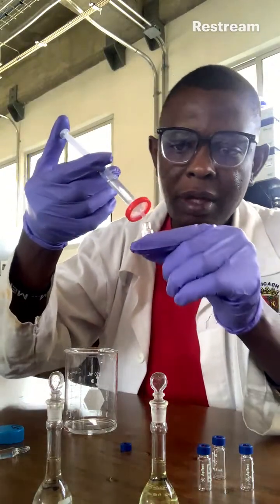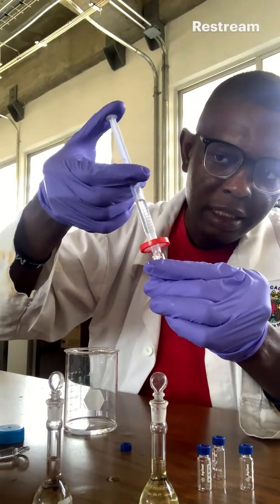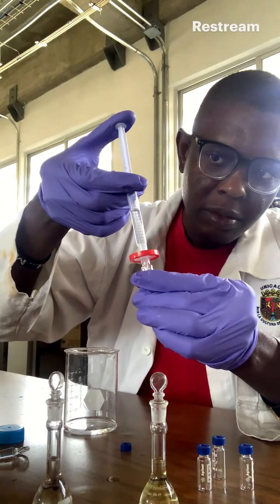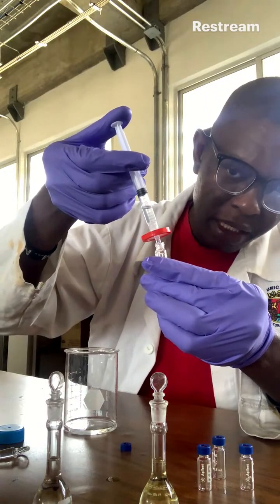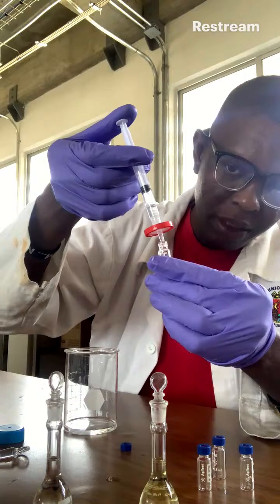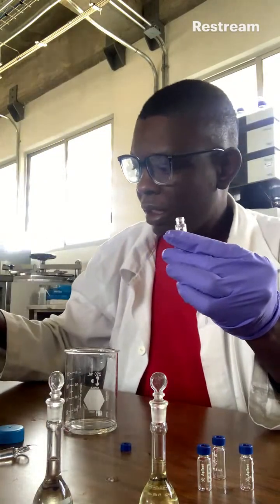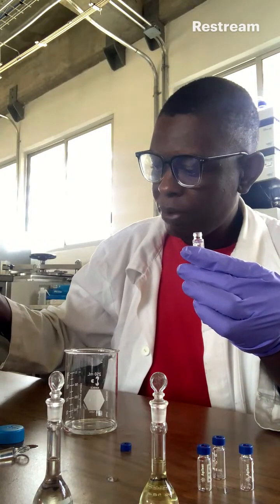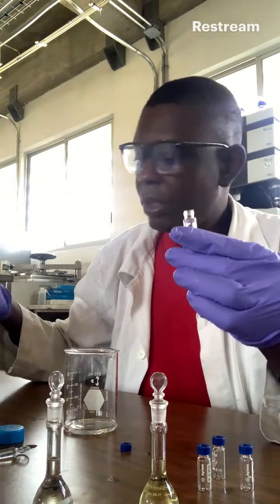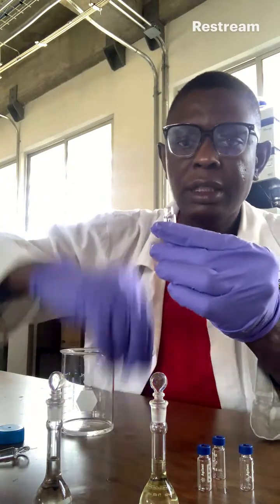All right, guys. So I am trying to filter so that I won't have a lot of dirt. I am trying to explain what I'm doing. I have taken my sample from this, and I will label it. I'll have to close it.